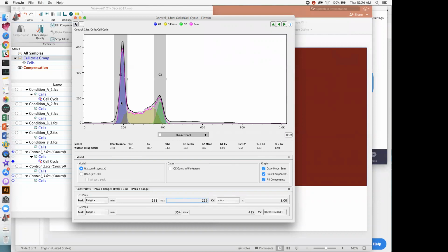We would expect in that case, when we saturate our staining, and if our cells happen to come from a clonal population or from the same species, that the DNA from cell to cell is exactly the same number of chromosomes, the same length essentially. We would expect that instead of being a histogram here, there would be just a single column. The reason there is not a single column here and there's actual spreading going on is because the cytometer has photon counting error.